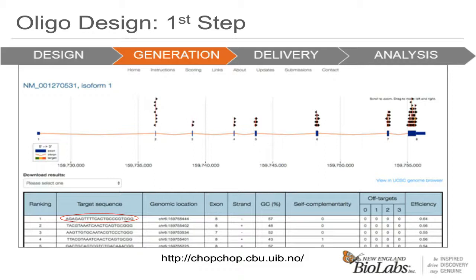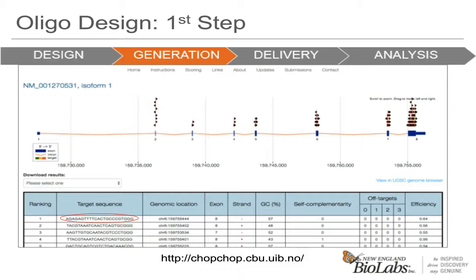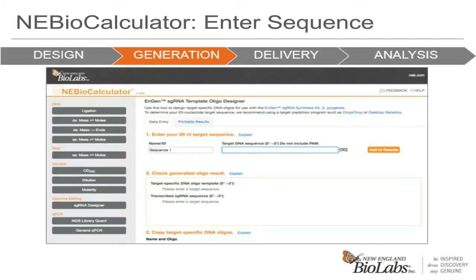On the NEB website, in the Interactive Tools section, you will find the NEBioCalculator. Once you click on this, it will take you to the calculator where you can select the sgRNA designer tab on the left-hand column. In the window labeled 'target DNA sequence,' you can paste your 20-nucleotide sequence. The tool will track how many nucleotides you enter and has several fail-safes built in. It won't let you enter non-nucleotide sequences, and it will warn you if we think you have added the PAM by mistake.